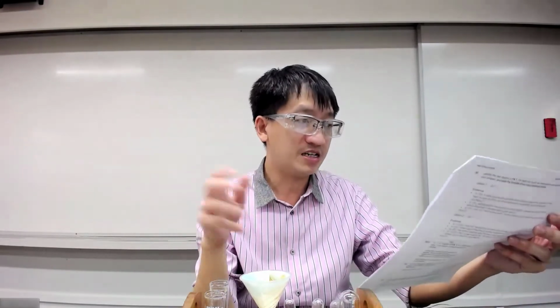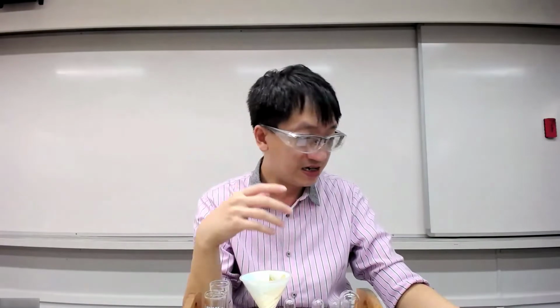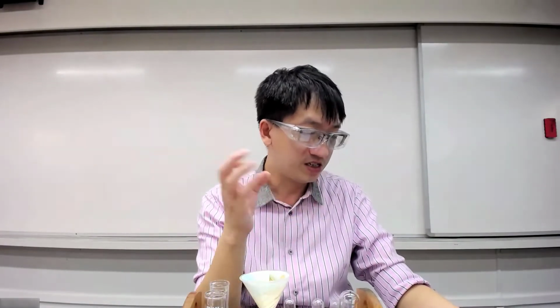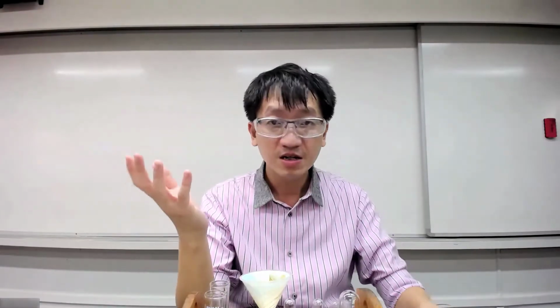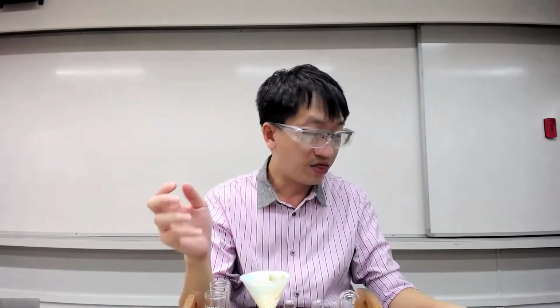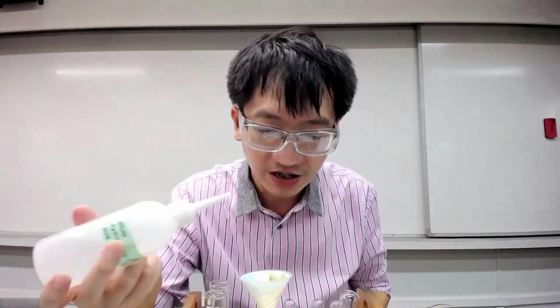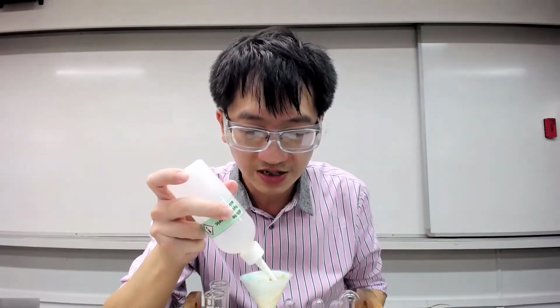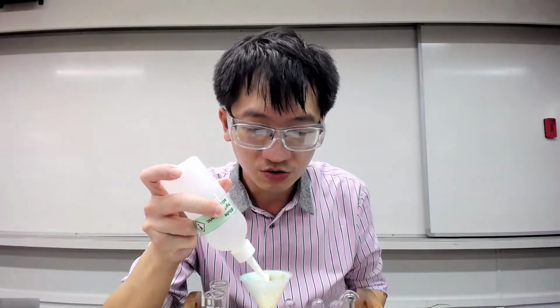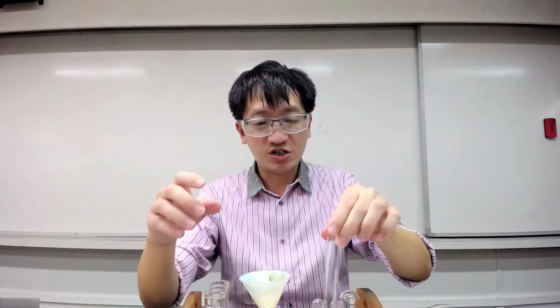So for C part 2, you're supposed to take 2 cubic centimeters, put it in a boiling tube, and then put some zinc inside. And for C part 3, just 1 cm depth, and then I'm going to add aqueous ammonium thiocyanate. We probably will do C part 3 first because it's actually easier. I can see that quite a bit of it dissolved, so I'm going to put a little bit more. Again, as I mentioned, you don't need to wait for everything to complete. So what I'm going to do is change over.